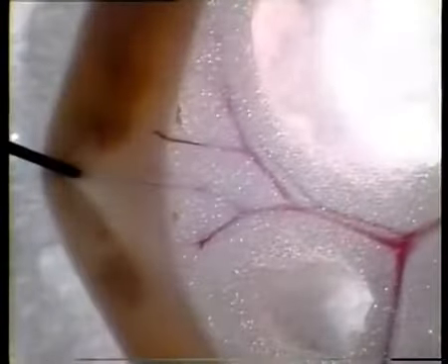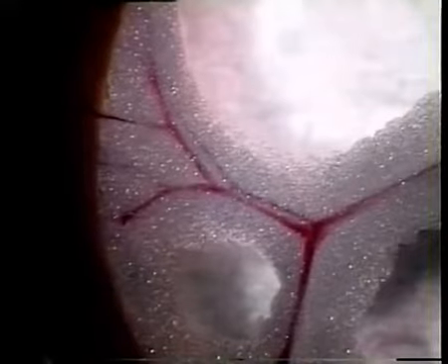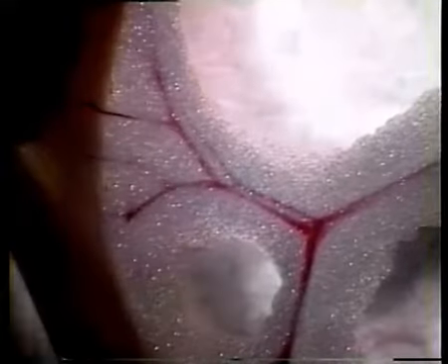The vessels branch out from the central superior mesenteric artery and corresponding vein. Close to the gut they branch further into an arcading system. Here you can see how much stretch you can use without damaging the vessels. In situ, these tissues will normally be subject to a substantial amount of stretch from the movement of the body. Some stretch on the tissue is necessary to aid the following microdissection.